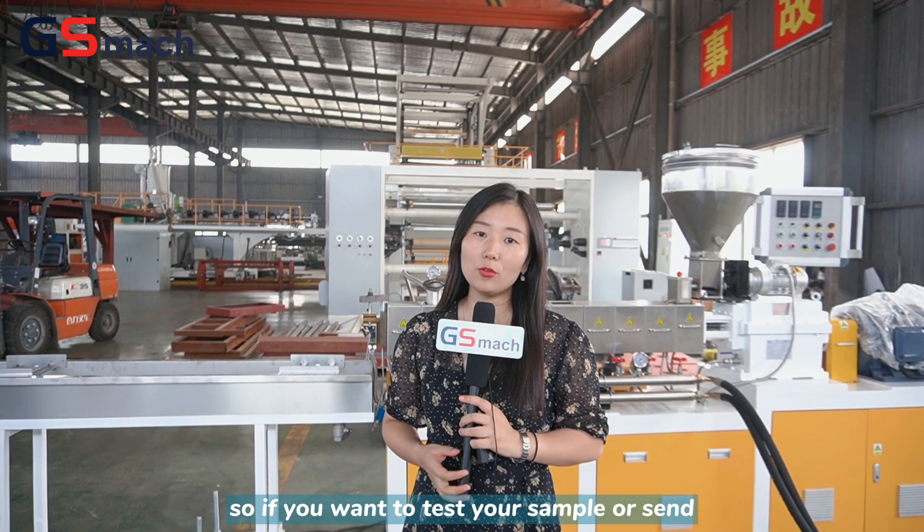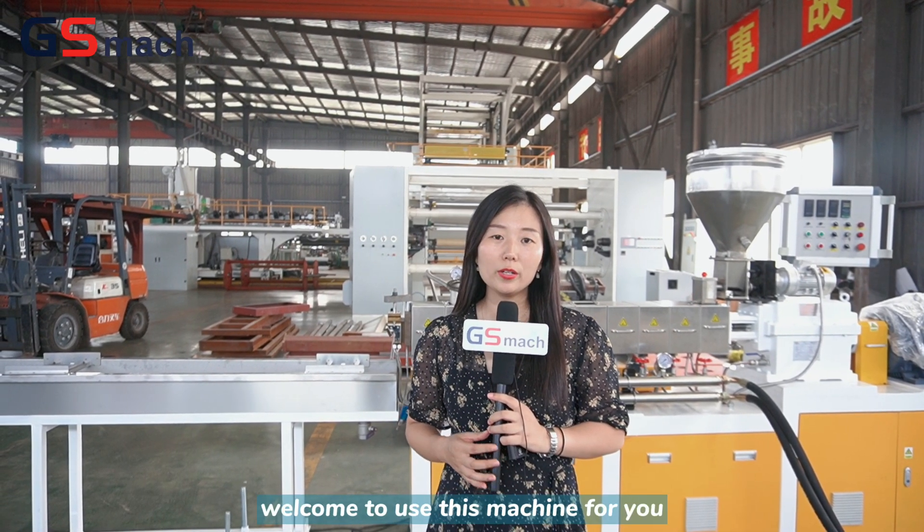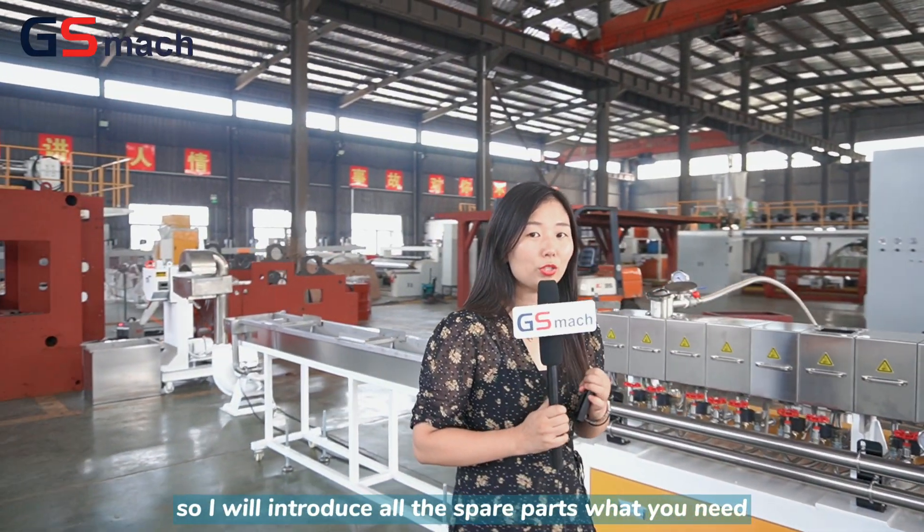So if you want to test your sample or send some material for testing, welcome to use this machine. I will introduce all the spare parts that you need.